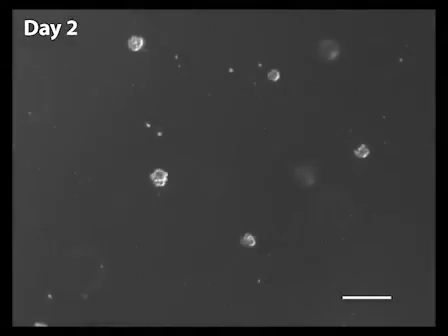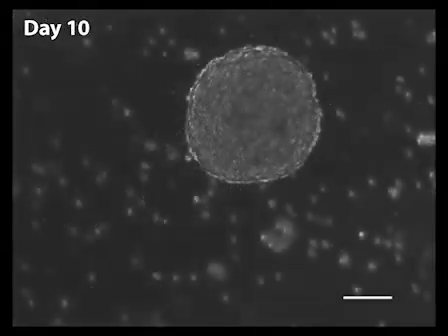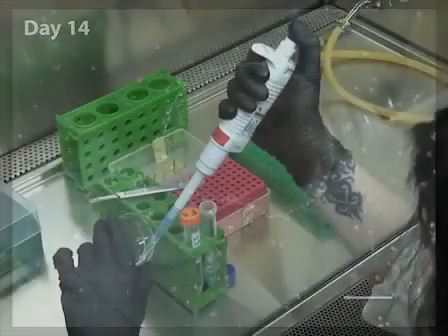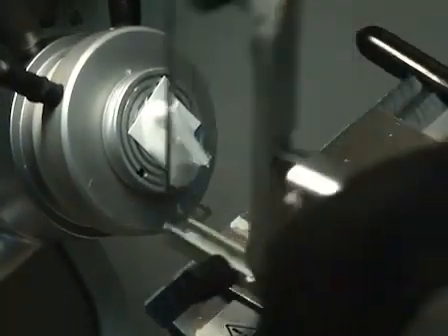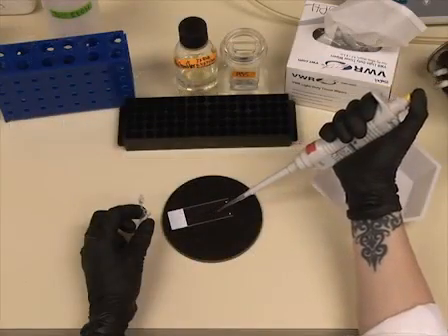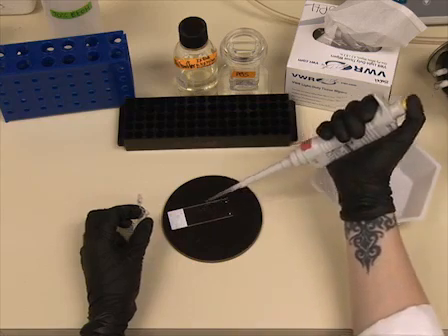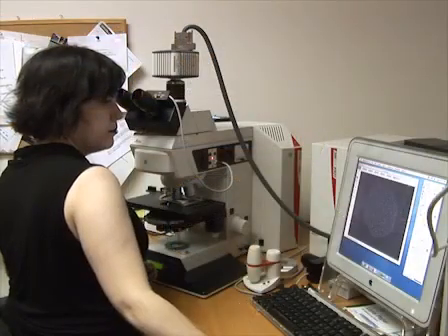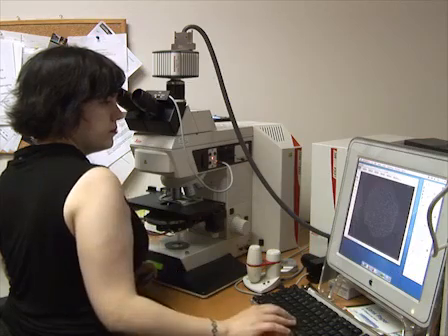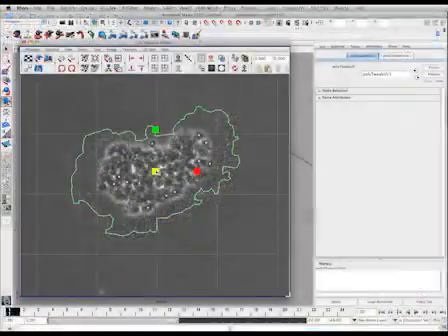When grown in suspension, neural progenitor cells isolated from neurogenic niches of the brain proliferate to form neurospheres. Here we show the isolation and serial sectioning of free-floating postnatal hippocampal-derived neurospheres. To locate protein expression within the three-dimensional neurosphere, we will perform immunostaining for a protein of interest, in this case connexin 29, followed by assembly and translation of two-dimensional microscopy images into a three-dimensional reconstruction of the neurosphere.